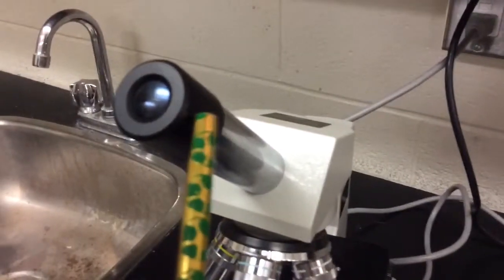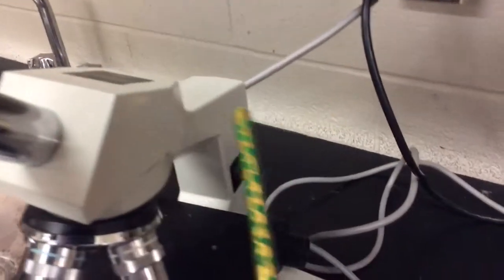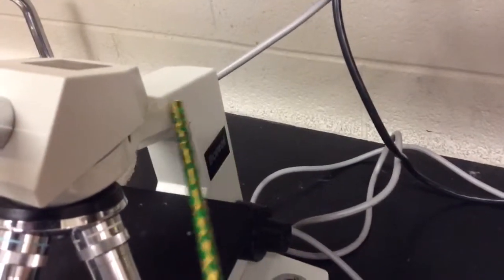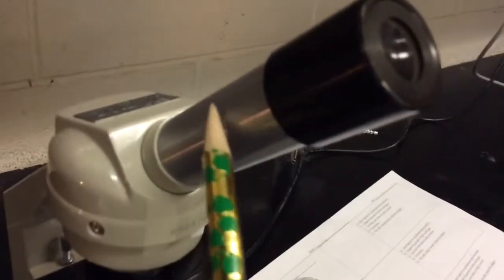What do we call this part here? The eyepiece. Awesome. And then this guy here? The arm. Okay. So the question is, what do we call this part here? Body tube. There's the pencil. Real life.